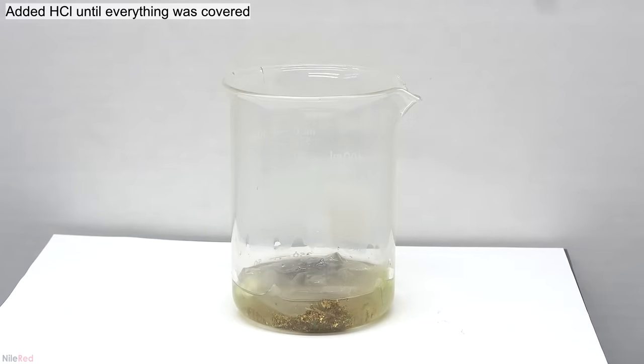Once all the gold has dissolved, we're left with a nice yellow solution. The gold solution is then filtered through a coffee filter, and our original beaker is washed with a little bit of water. The contents of the coffee filter are then repeatedly washed with distilled water to try to get out as much gold as possible. Gold in solution will have a slight yellow color, so we'll know we're done washing when the stuff that filters through is colorless. Eventually it looked like we were just filtering through plain water, so the filter was removed.